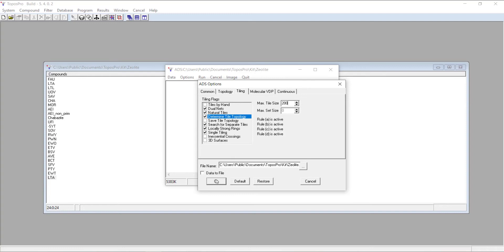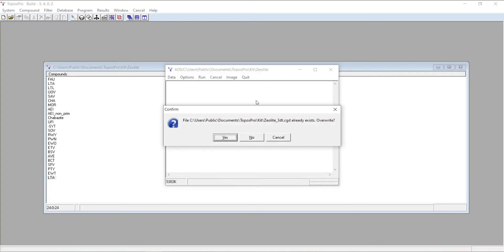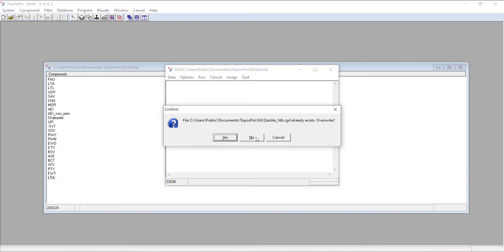Then we can click OK and click run. It's going to ask if we want to overwrite this .cgd file. This is what's read into 3DT. If you overwrite it, it will replace it with only the tiling you're calculating right now. If you say no, it actually appends it to the end of the file. Same thing for the .tnt.